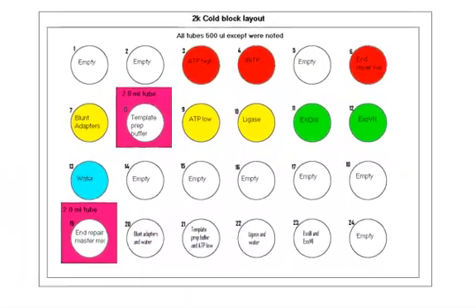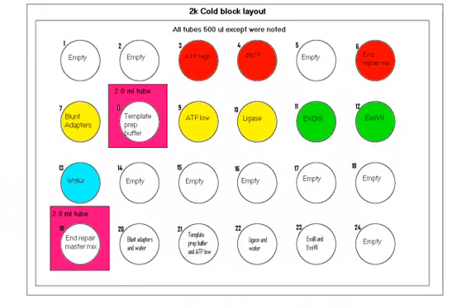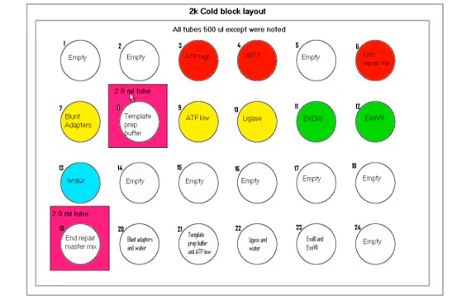If you chose to have the Biomek make your master mix, it'll pop open this window, which shows you where to place the kit tubes in the cold block. But it'll put the master mixes in the exact same place as they were in the previous picture. But you have all your kit tubes up here. Note that there's a 2 mil tube for your template prep buffer in the kit that comes in a 2 mil tube. You'll still also have your 2 mil tube at your end repair master mix. All the other ones will be 500 microliters tubes.